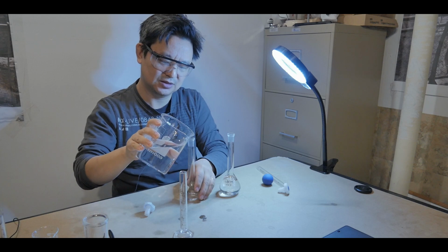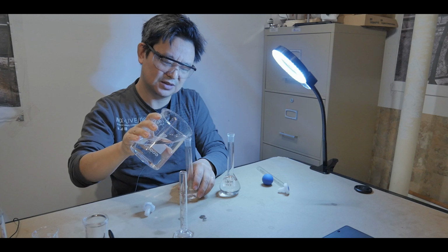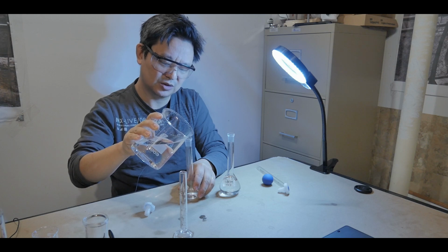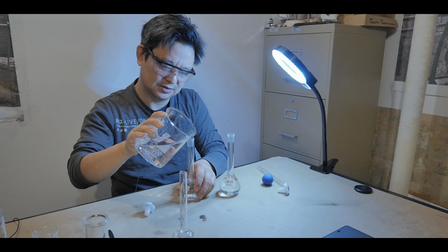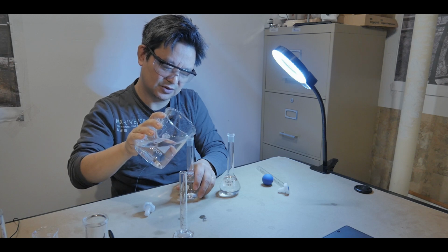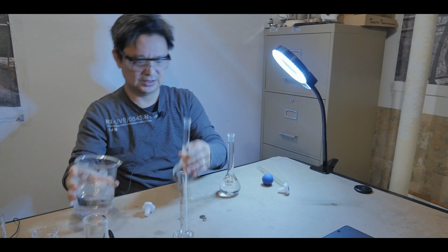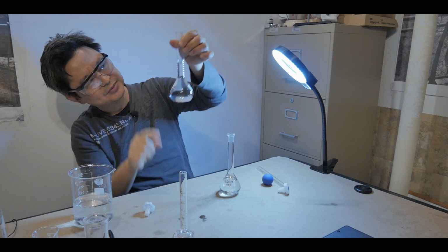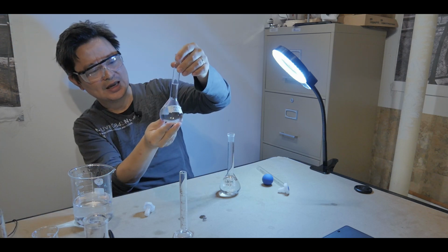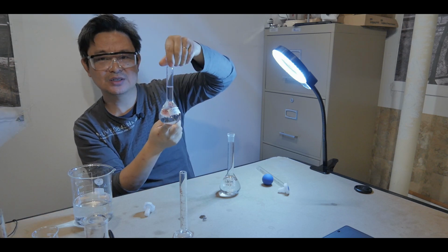So let's do that. Just be careful, you don't want to go over the line here. When you go over the line, then obviously this is not 0.1 molar concentration anymore. So we add 90 mils of water, or up to that line. Okay, so now this is where we want to be careful here. Make sure there's no bubble. Yep, okay, good. So if you look at the line, the meniscus is exactly lining up to that edge. So now we have exactly 0.100 molar concentration of hydrochloric acid.